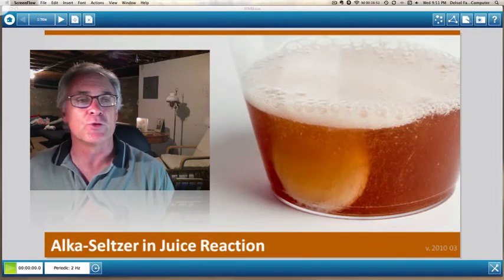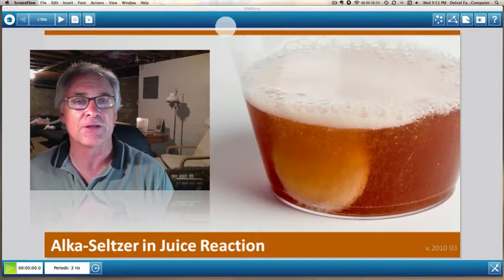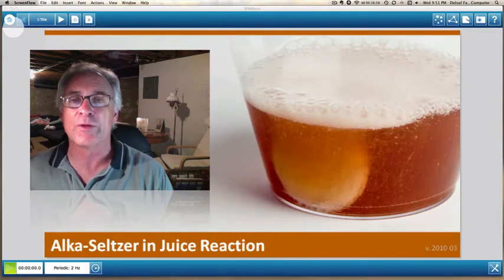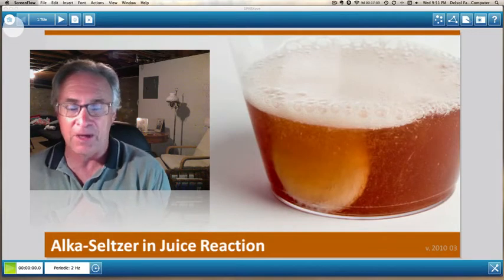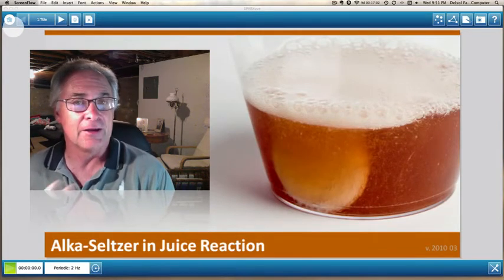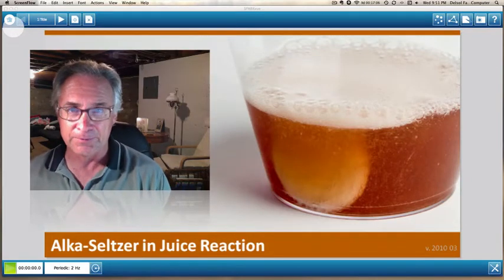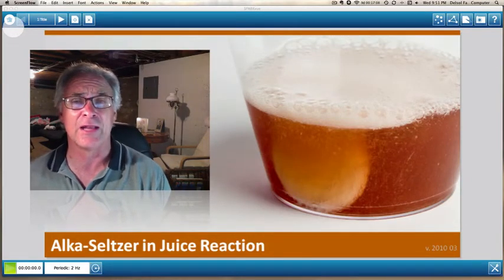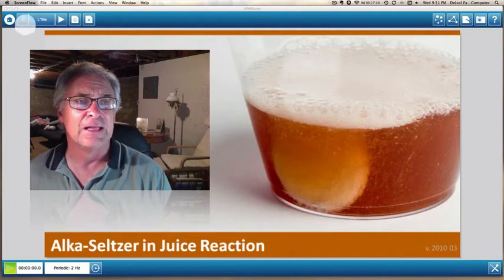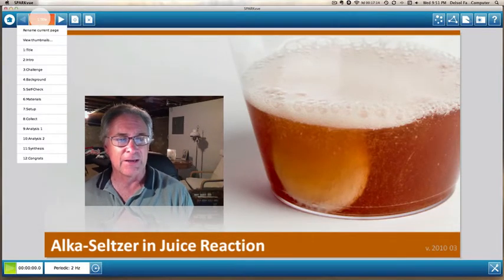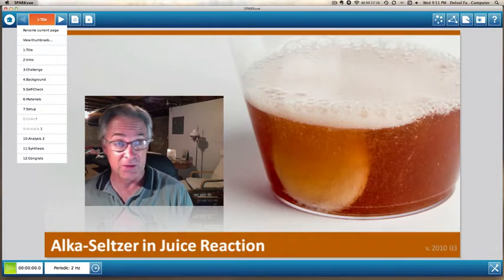So let me first of all start with the tools here on this top bar. This picture of a house is where we go to the home page. So if you have gotten your data logger and turned it on, it goes to the home page automatically. And this is the navigation bar. As you click that, it scrolls down to various pages within the lab that you're doing.